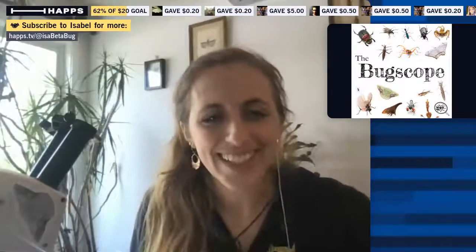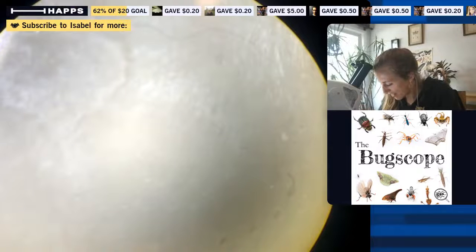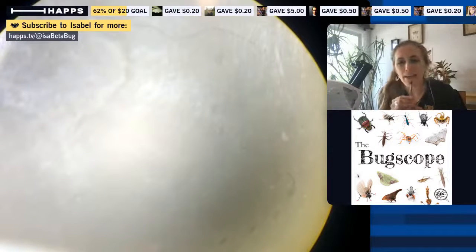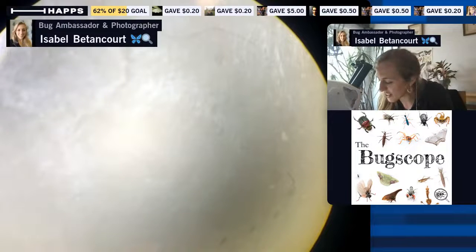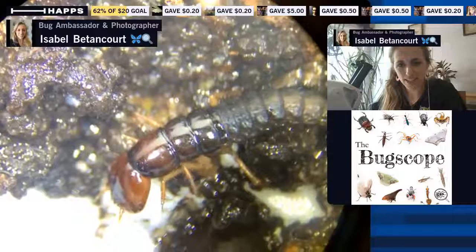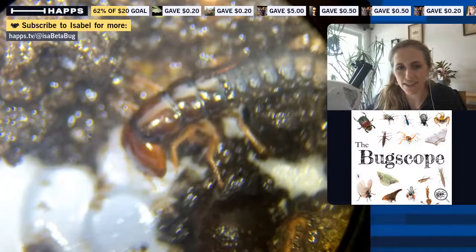Hi Christine, hello over in Switzerland — great to have you here. Hi Peter, hi Pablo, hi Matias. Okay, invertebrate guessing — I'll bring it on screen now. Oh, it ran around the cup, I need to relocate it. Forceps are always good to have when handling insects, especially small ones, because you don't want to squish them. Here's our bug — oh, there's a little springtail in there too, but here is the insect I found in the backyard under some leaf litter.